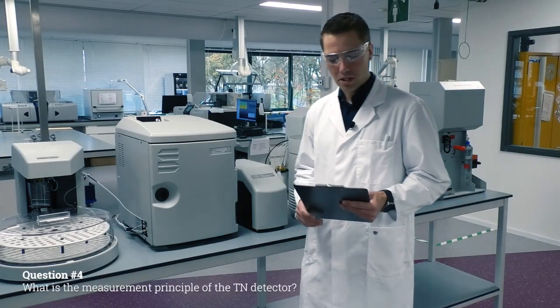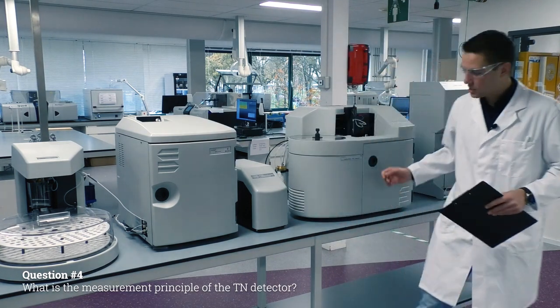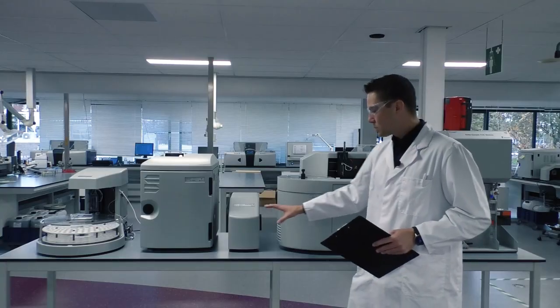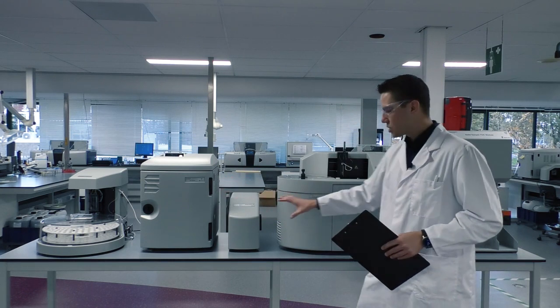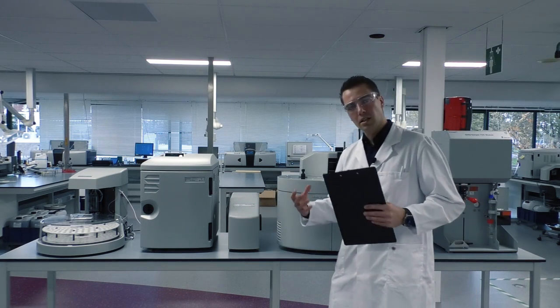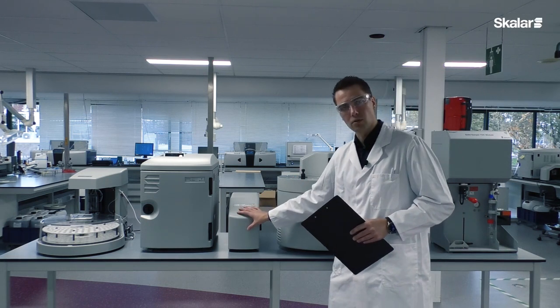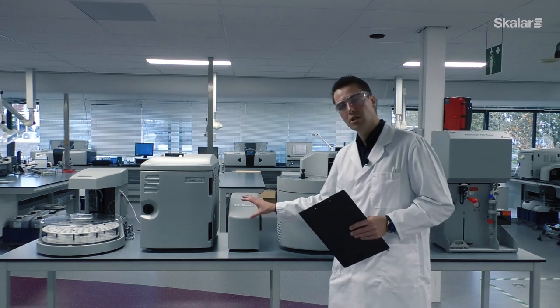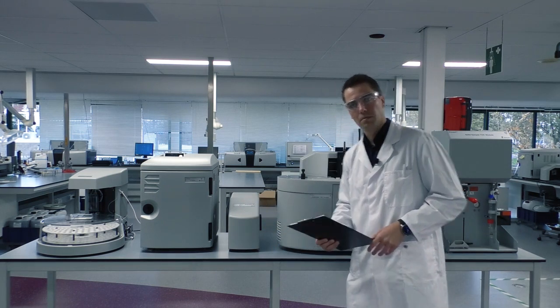Question number 4. What is the measurement principle of the TN detector? As said before, the FORMACS HT and the FORMACS HTI can be equipped with a TN detector, standing here in the middle of it. The measurement principle is chemiluminescence detection. This means that the NO gases from the combustion travel to the detector. This is mixed with ozone, thereby reacting into NO2 in an excited state. This excited state falls to ground state and thereby emits a photon. This photon is then detected with the photomultiplier tube. This is a very stable and robust way of measuring, and it's a low maintenance detection.